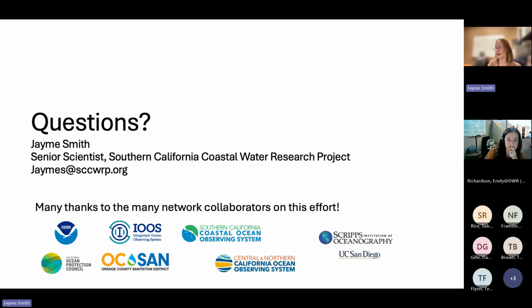Yeah, that's a great question. So some people do that. Lugol's is hard because it can change the morphology and it can change the color, and it obviously darkens the actual sample itself.